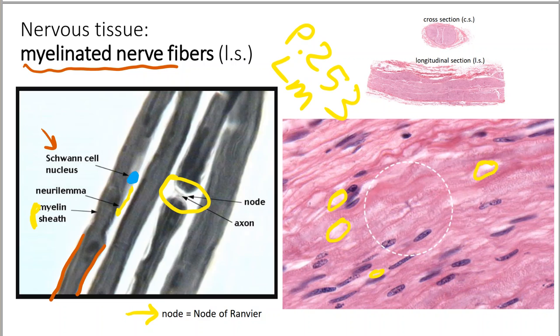If you imagine your neuron axon being like a bunch of little sausages, the gap in between each little sausage is a node of Ranvier. And that's what it looks like in the other types of cells. It's kind of like a butterfly with a dark center like that. Does that make sense?